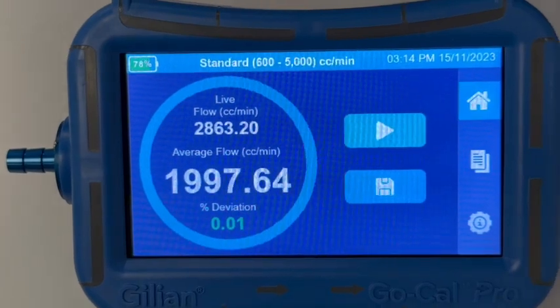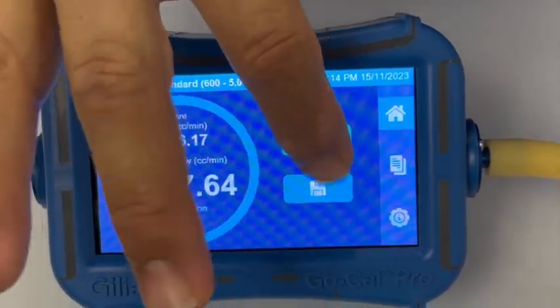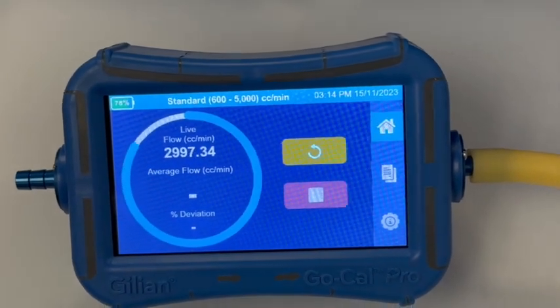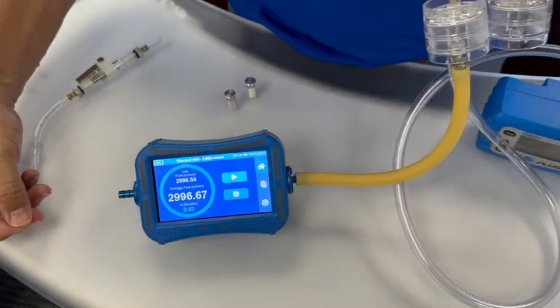So we're just going to fine-tune that one slightly up, and now that we've got it to where we want, we'll take a sample. Our average was well within one percent of our target flow rate of 3 liters per minute.